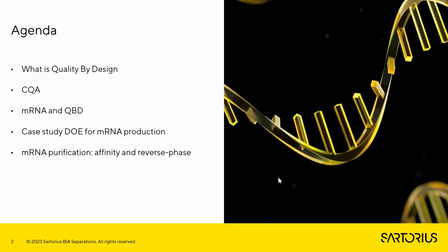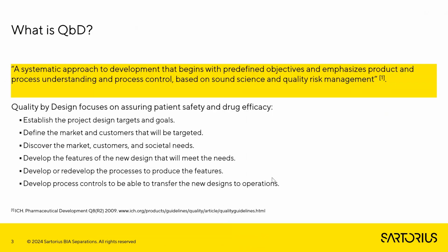This we will look at in the context of previous developments that got us to the application of DOE, and then we'll take the IVT product that we produce in high yield through to purification. And as Lauren mentioned, my desire is to take you through several stages of purification, tailored really to the highest purity mRNA that we see is being required today for mRNA therapies, where purity is key to clinical success of mRNA. So this is what I would like to cover in the next 40 to 45 minutes. Do stay with us for some exciting updates.